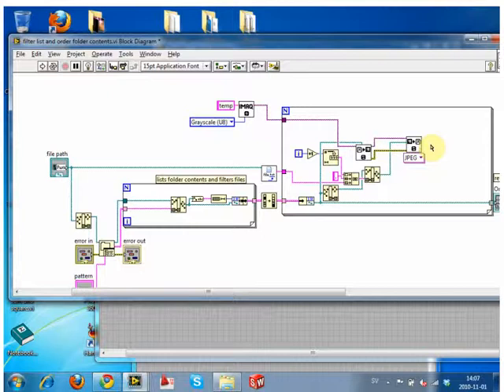Because we're not doing anything really computationally heavy, remaking an image file doesn't cost you anything. So it's much better to just remake it. All this does is remake the image file and then rename it, so that your original data set is never touched. As a general rule, that's what I would do. Don't touch your original data, remake it like this, and then you're fine.